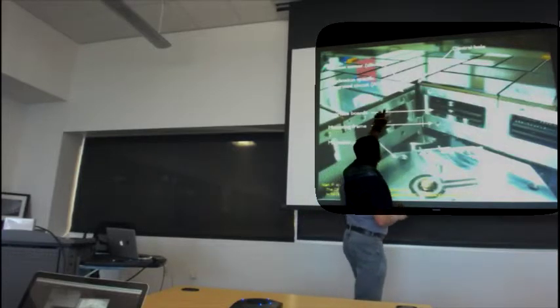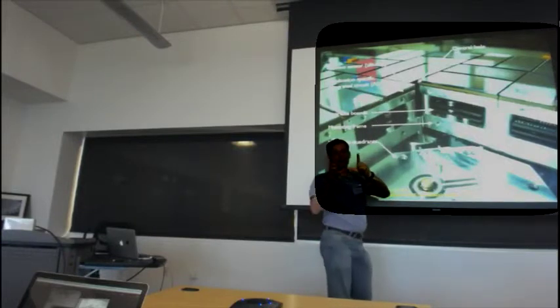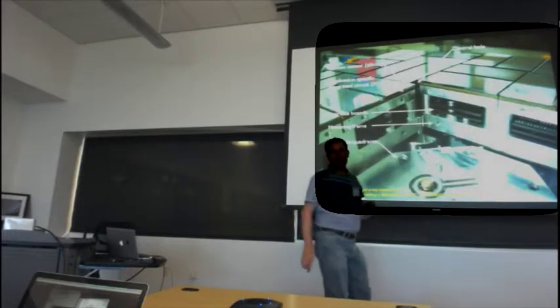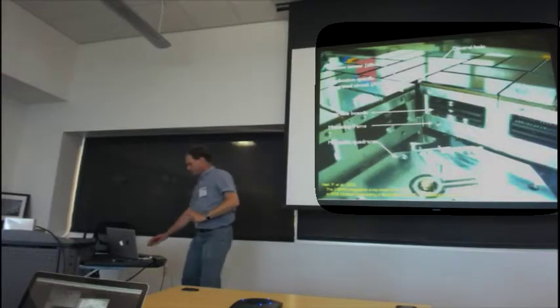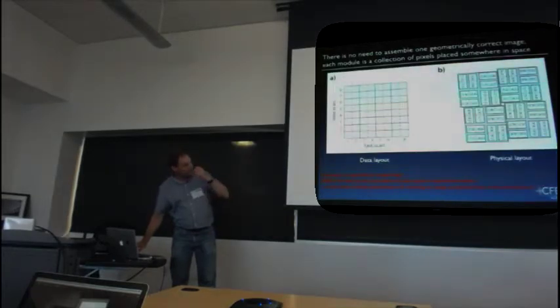You've got your photon sensor, it's bonded onto these bits here. So each of these ASICs, you can pretty much trust where the pixel locations are. But from rebuild to rebuild, each of those might be slightly different, and especially when you can translate these things around. I'm not going to go into the sample and hold amplifier back there.